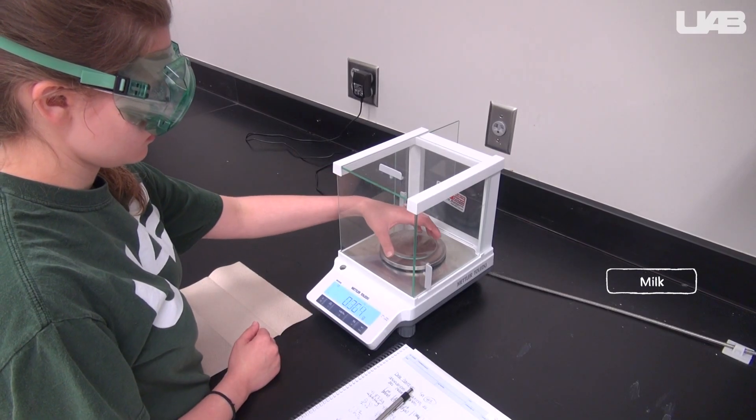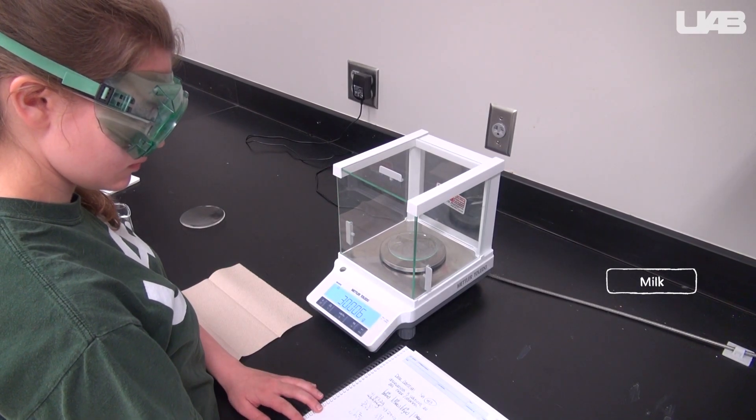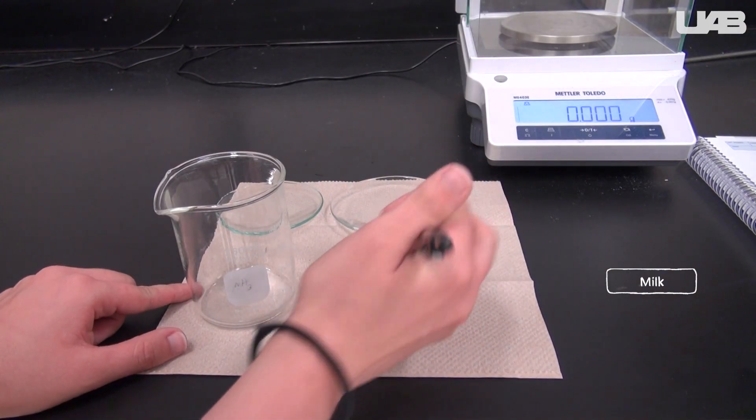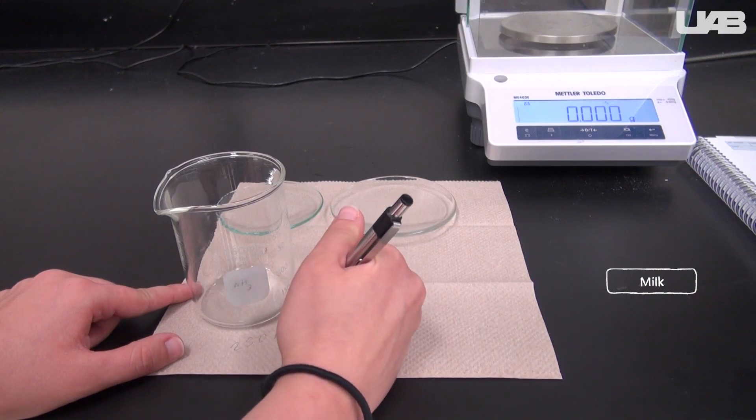You should also determine the mass of a 250 milliliter beaker and two watch glasses, then set them aside for later. Keep track of which is which. It may be helpful to use two different size wash glasses.